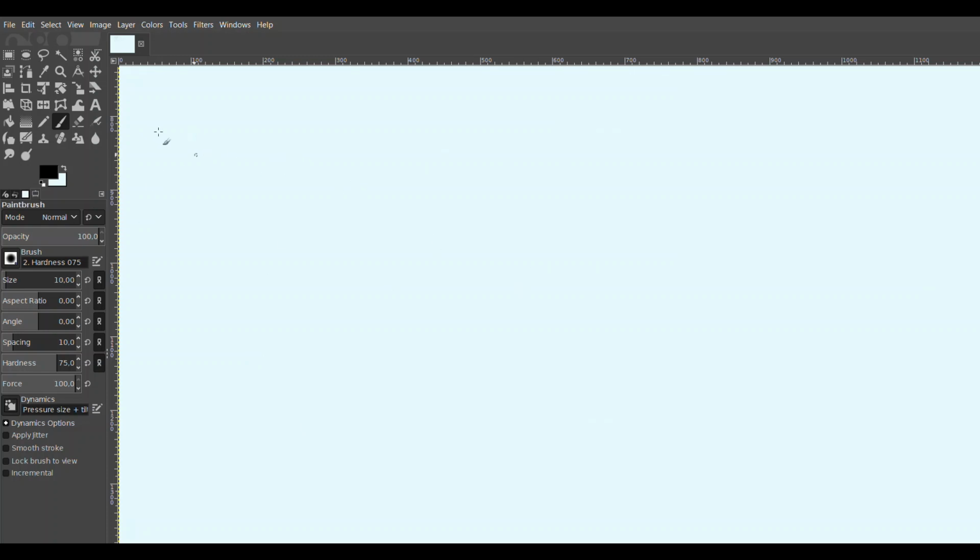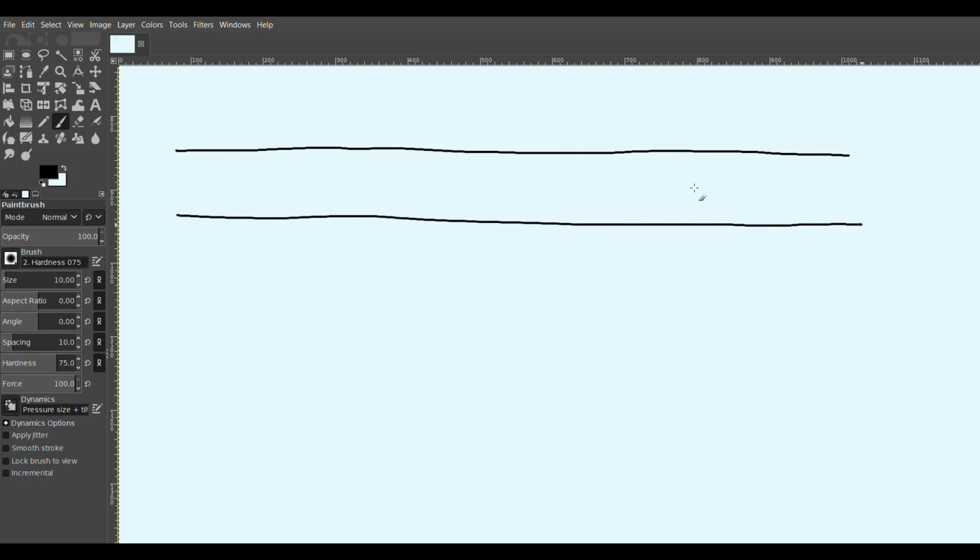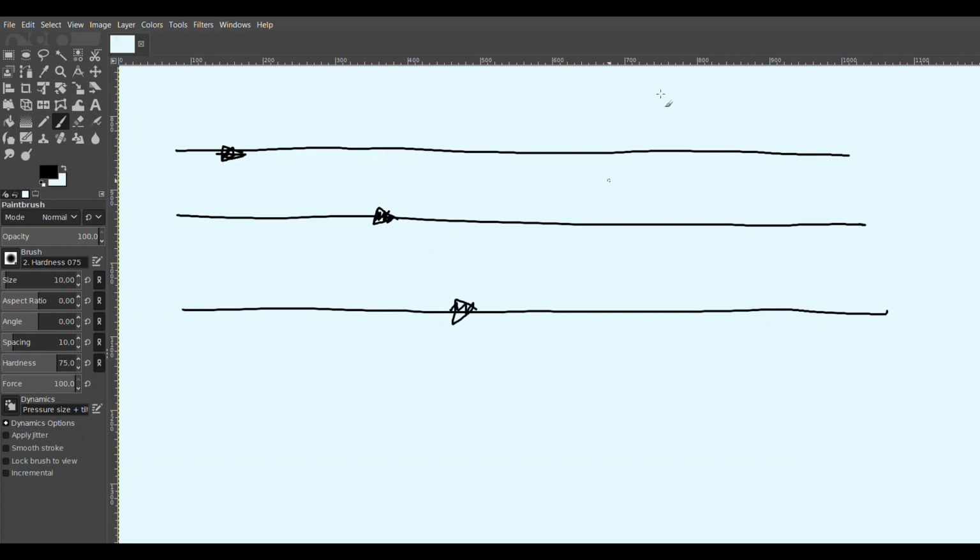So this makes a raster pattern like this, where the beam points. Just for clarity, there's how the magnet points, so it goes down this line, points down this line, goes down there.